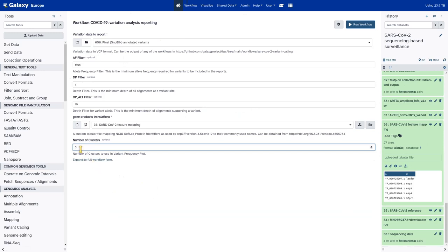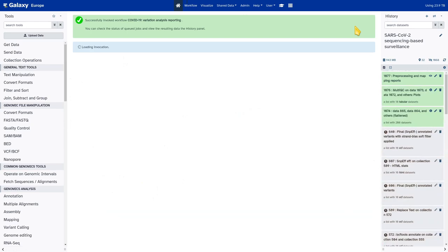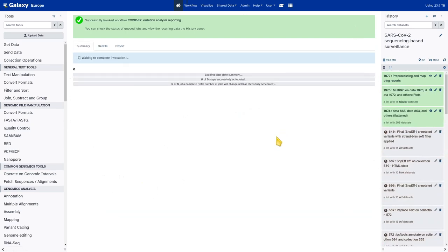Three is somewhat arbitrary — we go with it because for the suggested batch we established this to be a good number. Then we're ready to run this workflow and it will add datasets on top of the ones produced by the first workflow. We're back at the progress monitoring page again, where we see Galaxy preparing the invocation of this new workflow, adding datasets and summarizing the states of the different jobs.